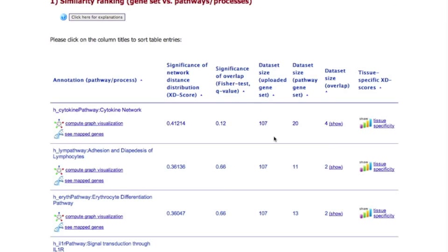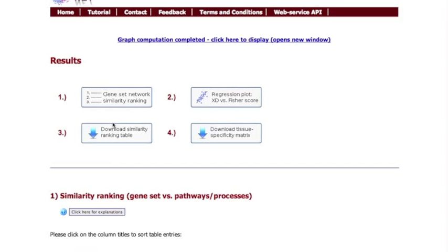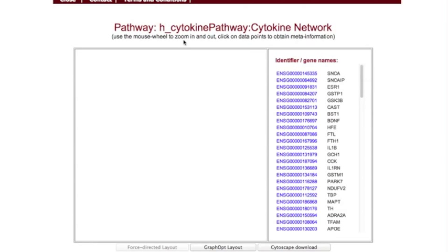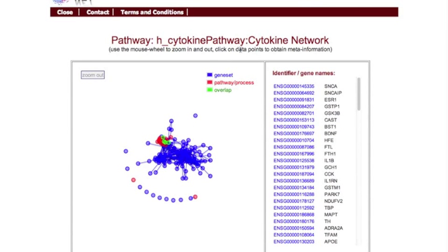However, the main exploratory tool is an interactive graph visualization of the gene set pathway associations. In this graph, blue nodes represent the user gene set, red nodes the pathway, and green nodes the gene pathway intersection set.